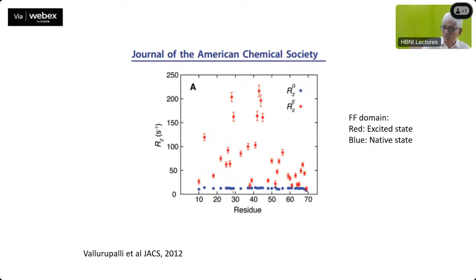It may be exchanging with more than one slow exchange. Then it is possible to see those different. As you are changing, you will be able to see that one. Exactly. This is a very powerful tool, extremely powerful tool, even though you don't see the signal. If it is 1%, you will not be able to see it. But if you keep it for some time, you see the signal, it decreases.